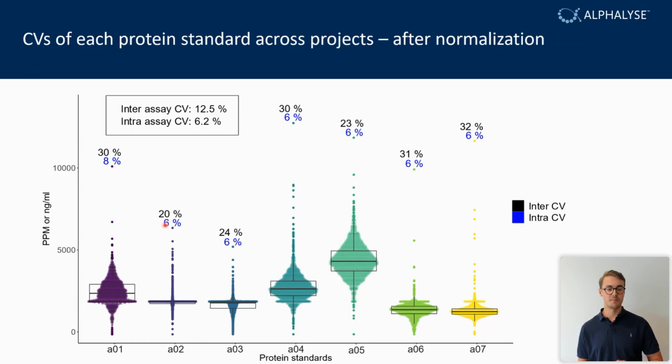But when you compare it across different projects, it's also very robust and precise. So one thing here is there is some variation in the accuracy. This is generally within what we would say a twofold change, and this is something to do with the different physiochemical properties of the different proteins. So some proteins will fly better than others.